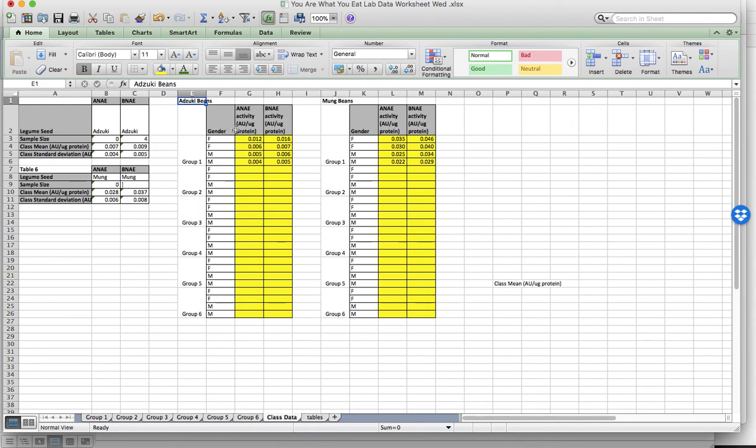So for the 2PS section, we actually use Azuki beans, and then this was black eyed peas. And for my Wednesday class, it's mung beans. Okay? So once you fill this in, this data will automatically be filled in for you.